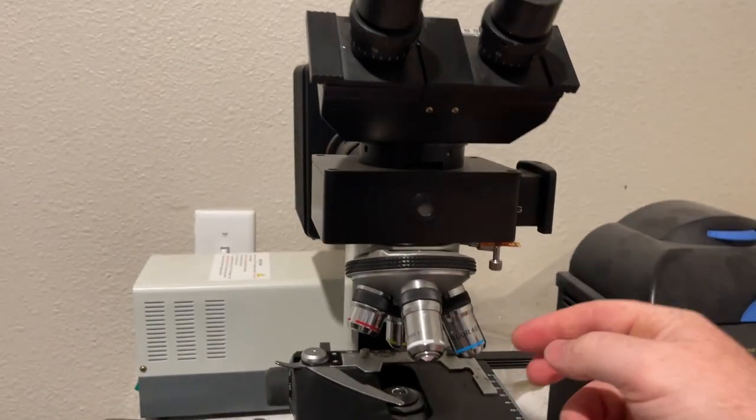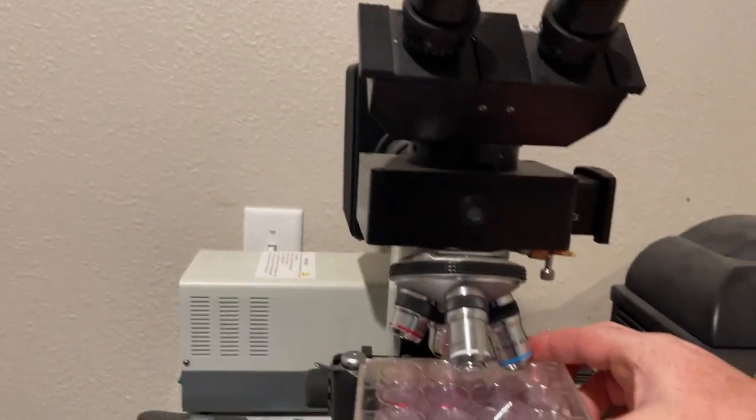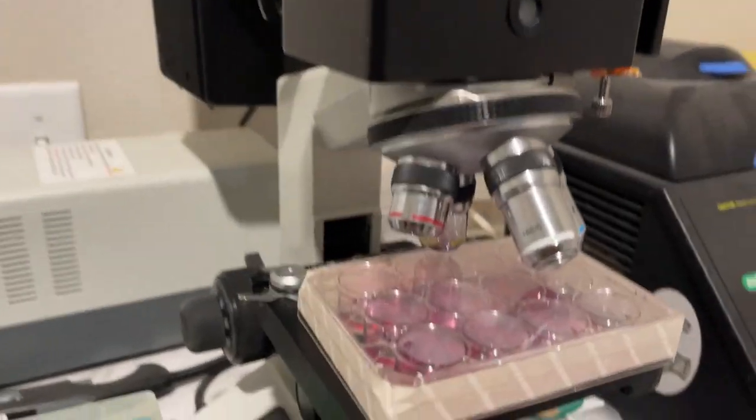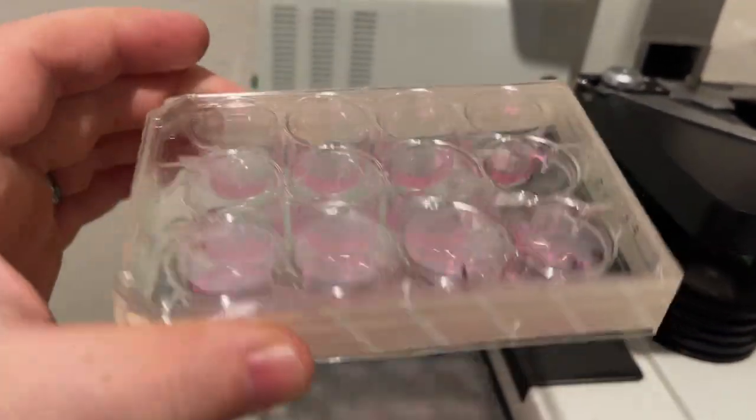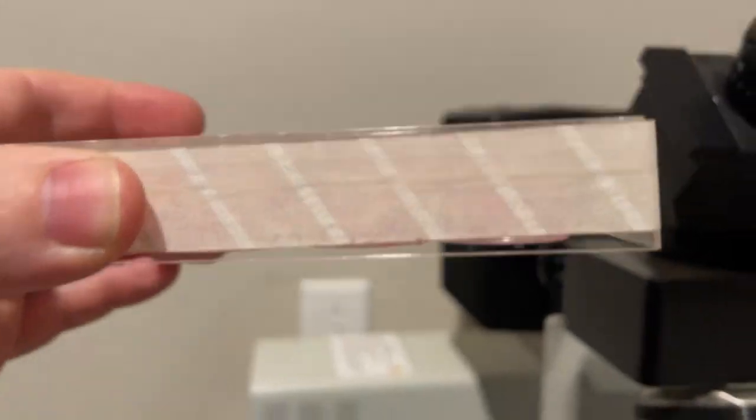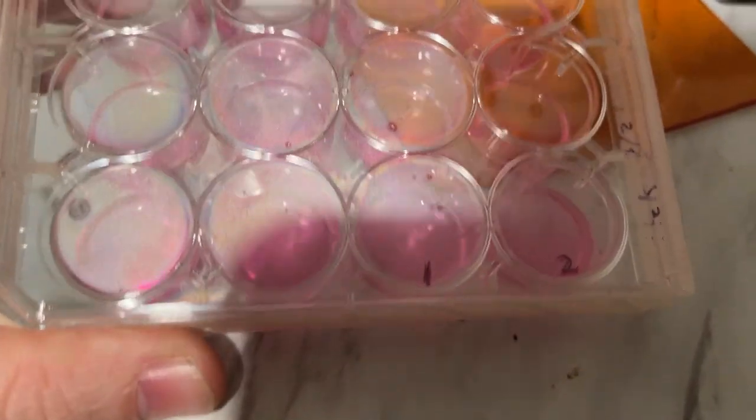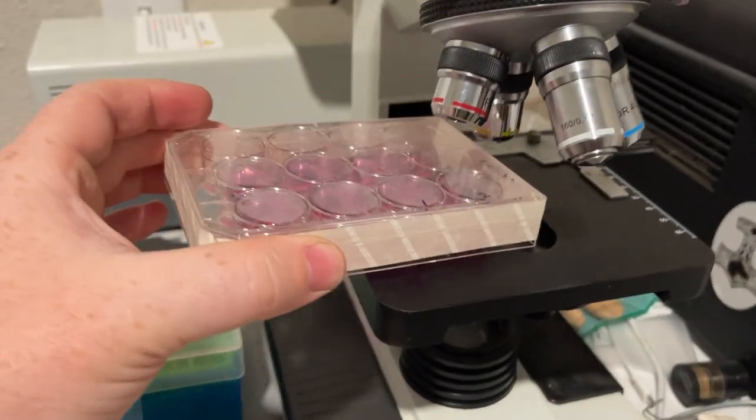This is not an inverted microscope. The microscope sees from the top down. It's for looking at slides. But when you're doing tissue culture, I have 12-well plates with human cells growing in them. These are HEK cells, and I've modified these two wells, well number one and two. And you see the problem.